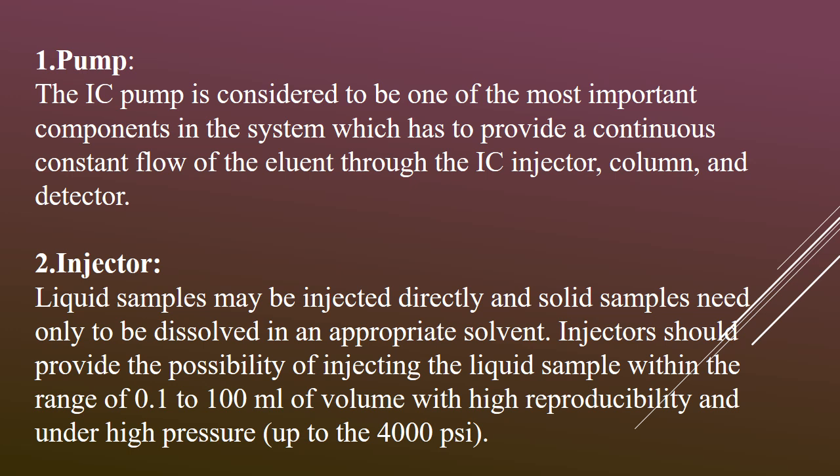Liquid samples may be injected directly and solid samples need to be dissolved in an appropriate solvent. Injection should provide the possibility of injecting the liquid sample within the range of 0.1 to 100 ml of volume with high reproducibility and under high pressure.